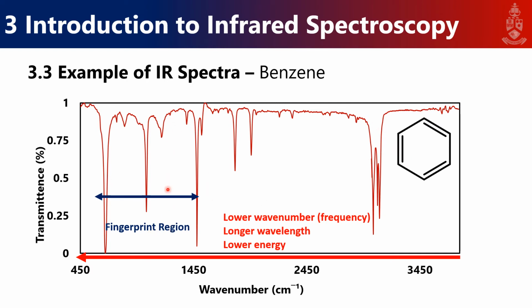If you see all of a sudden there's another peak here, then you know it's not benzene. And IR isn't very specific, you don't usually use IR on its own, you use it in conjunction with a bunch of techniques, but we will use IR in this method. So we will look at specific regions and apply our knowledge of what we're trying to look for and say, are we seeing that? Okay.